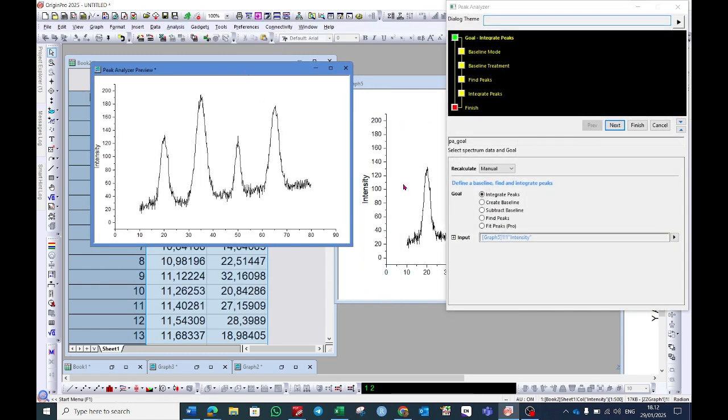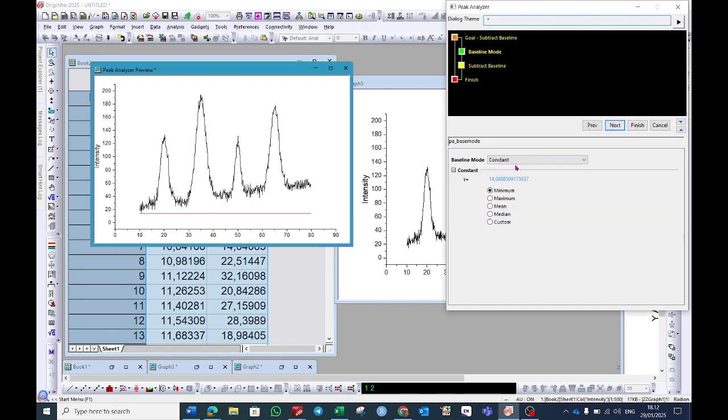A dialog will open. Here choose subtract baseline. Then click next. Here it shows what is the baseline at the moment. So we will make a baseline correction.